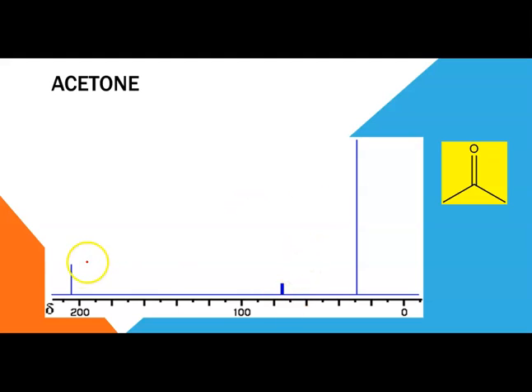So if you remember, this peak here, far past 200, and this peak here, closer to 0, tells us we have 2 types of carbon. But if we look at the structure, we see that we have a total of 3 carbons. Now we have this 77, which doesn't count as either one of them. So be careful. Don't see this as 3 peaks or 3 types of carbon, but really 2 types of carbon and 1 representing the solvent. Now, sometimes they don't show the solvent, and sometimes they do. Just look for that 77.